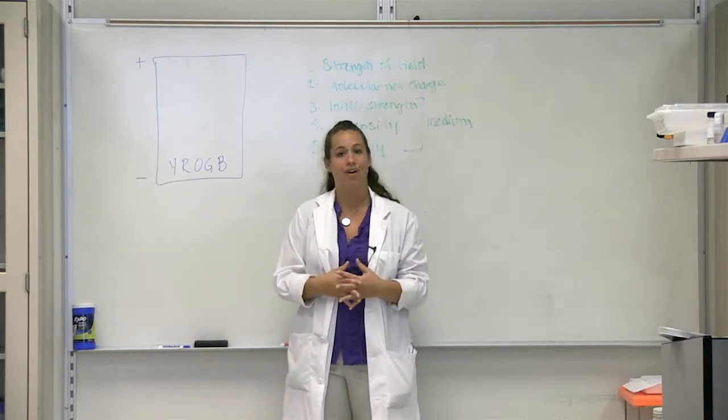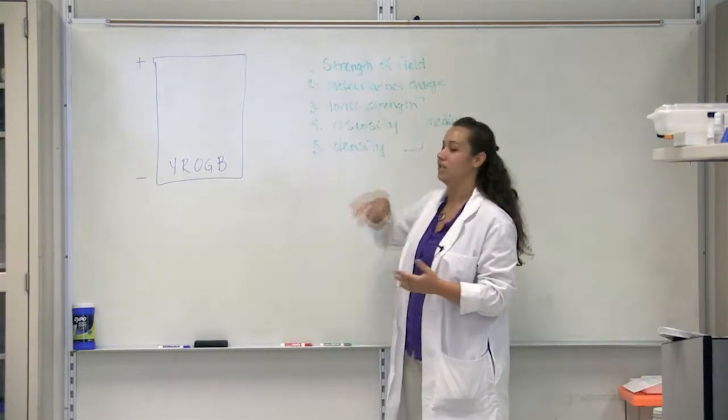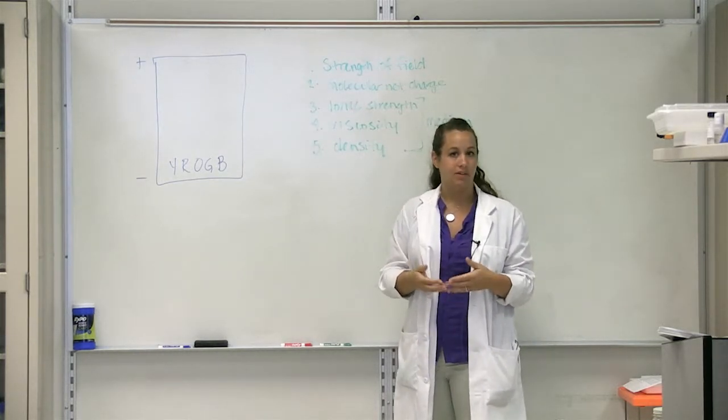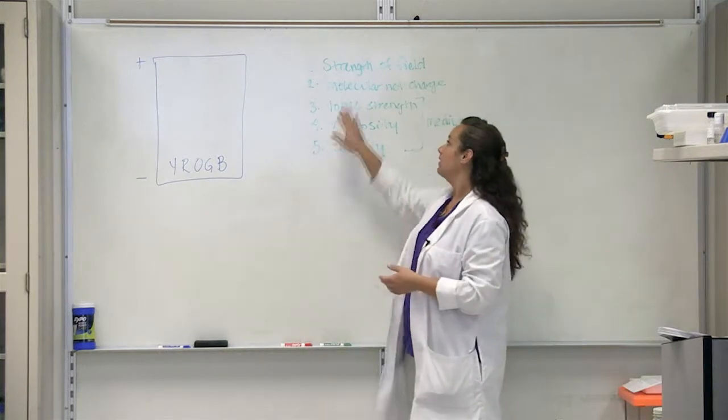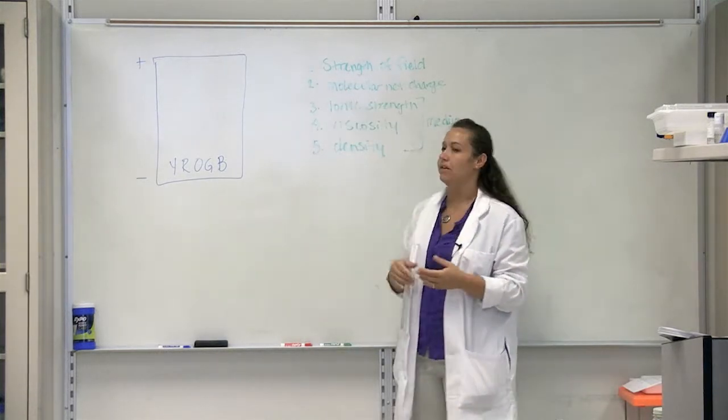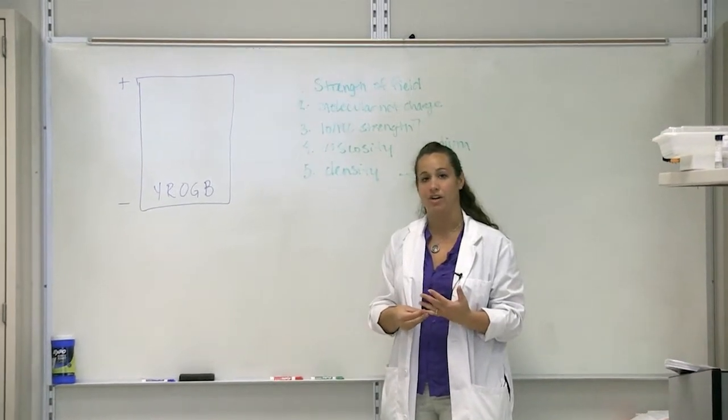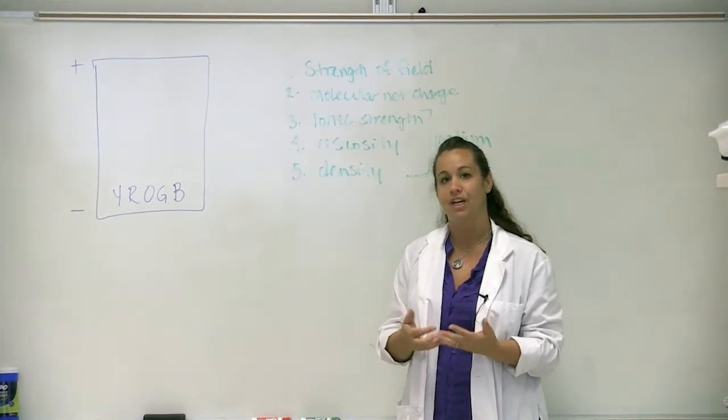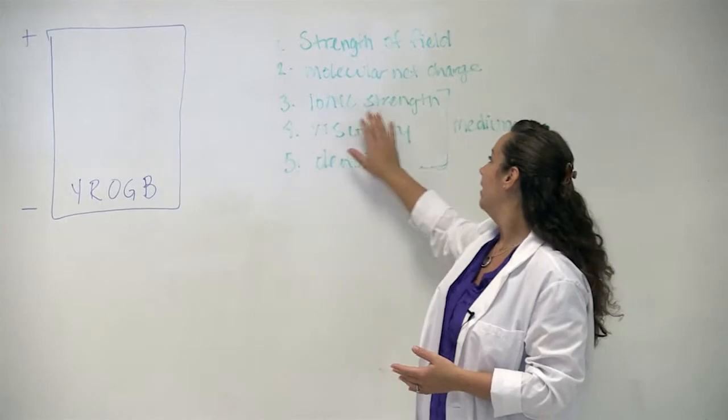If things go wrong, there are several things that you can consider. So the first thing that you can consider is the strength of the field that you're using. Did you use enough voltage? Do you need to increase your voltage? Do you need to decrease the voltage? Something to consider. The next one is going to be the net charge. Are you sure that you have assumed the correct charge? DNA is negative, but protein is one of those things that can change charge depending on the pH of its surrounding buffer.